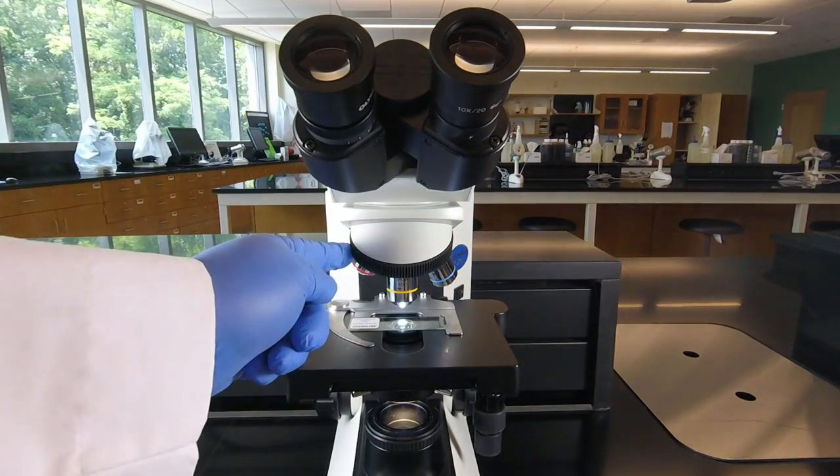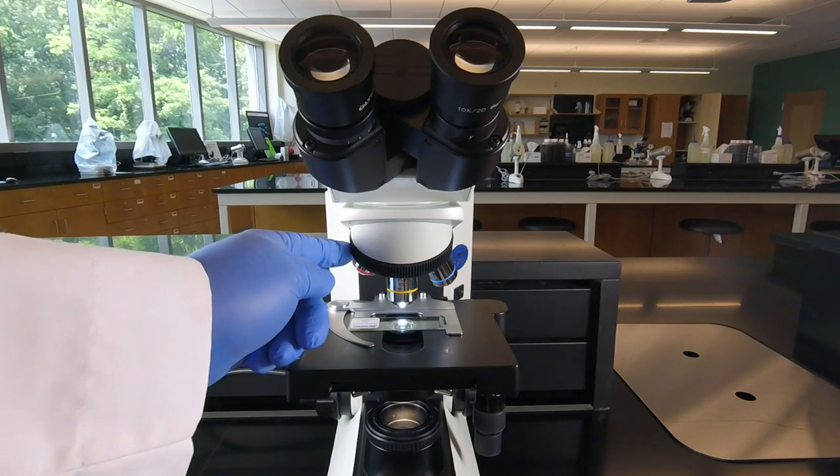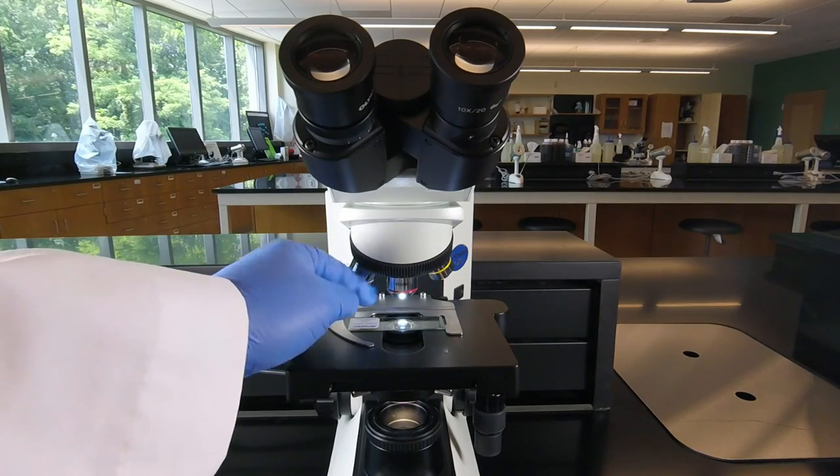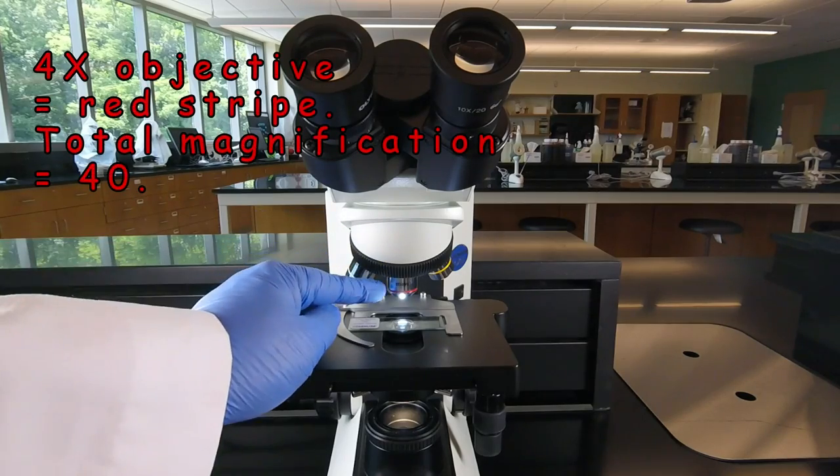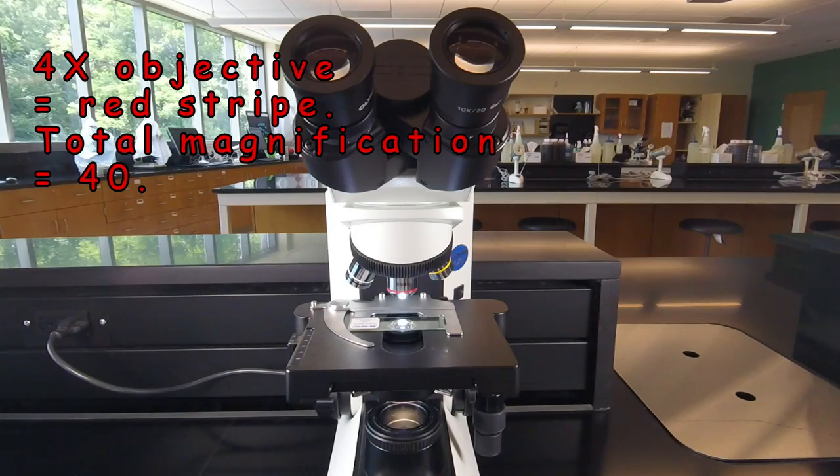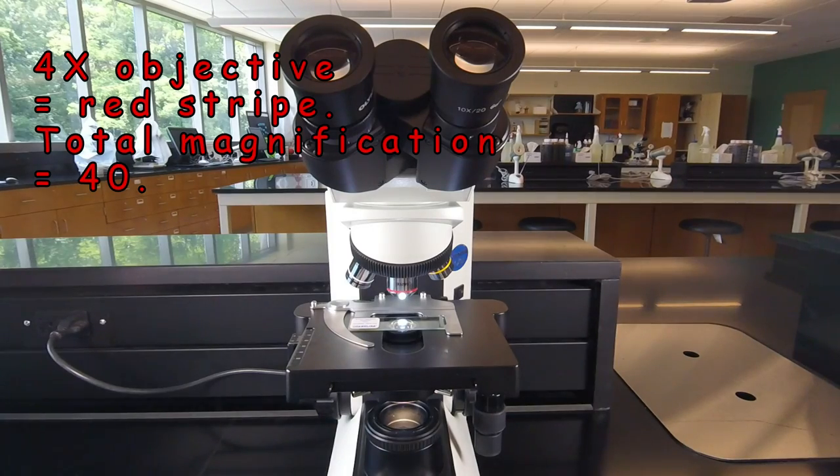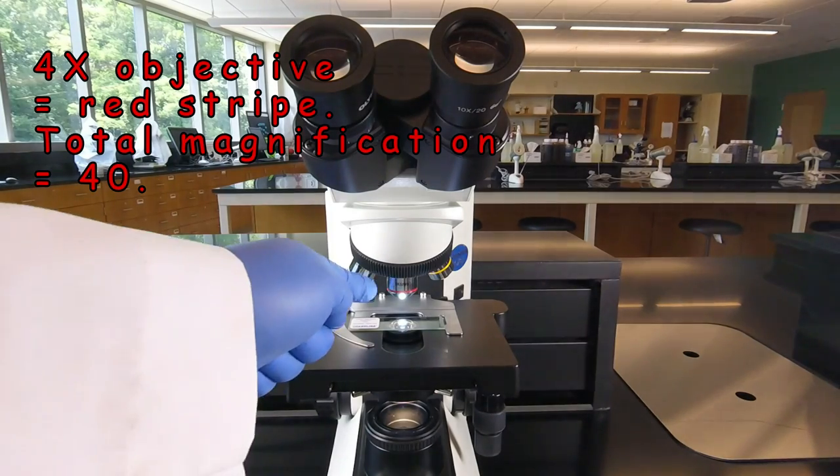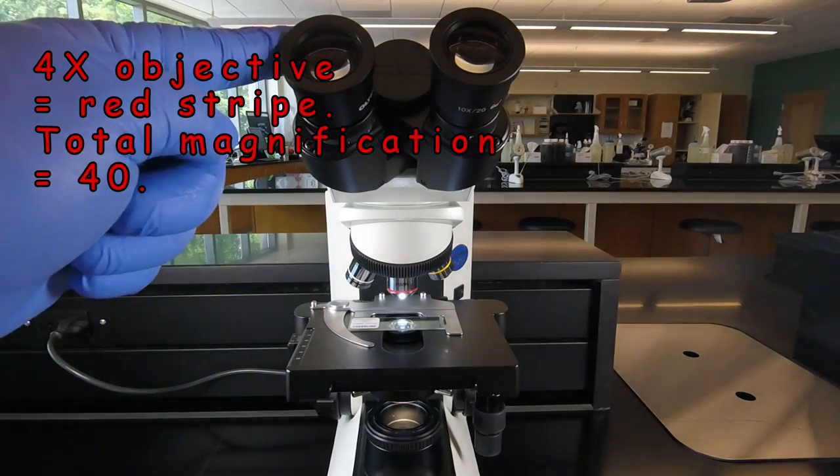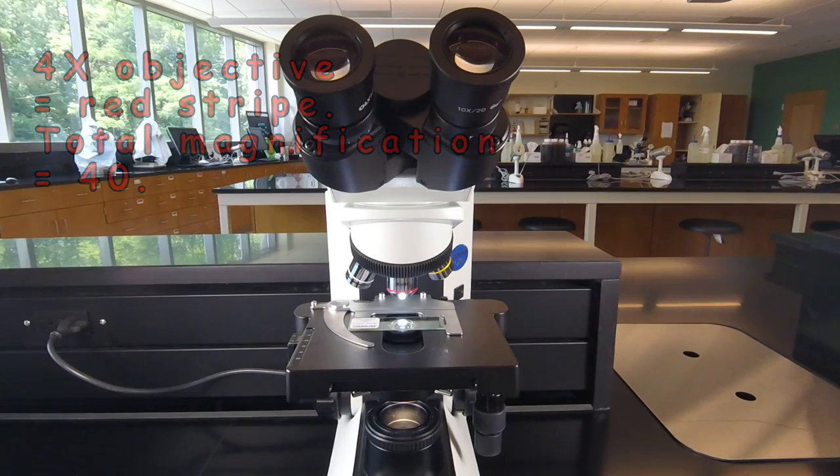But then on a turret down here, we have a number of different objective lenses. Most of the microscopes have a red striped lens. That's a 4x lens or a four magnification lens. Now the product of the two lenses gives us the total magnification. So if we're using the 4x lens, which we won't use because the magnification is too small for this class, it would be 4 of the objective lens times 10 of the eyepiece. We'd be seeing the image 40 times its normal size.